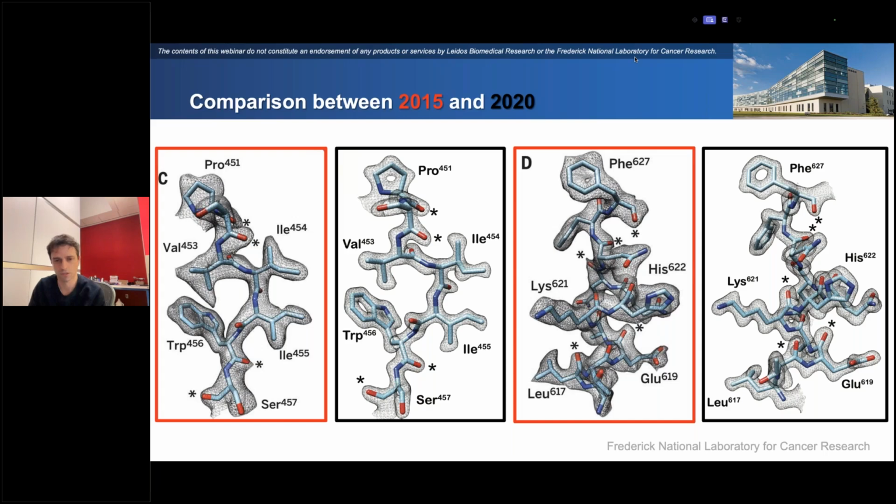So after we started seeing those consistently in our map, and then we recalled what Dmitry had published, we put two and two together and realized, oh, that's what they are. Because when we were first seeing it, again, we weren't sure whether it was noise or potentially coming off the parent atoms themselves. But once we saw the location and the quality of them, and since Dmitry had already seen these, we kind of knew what they were.